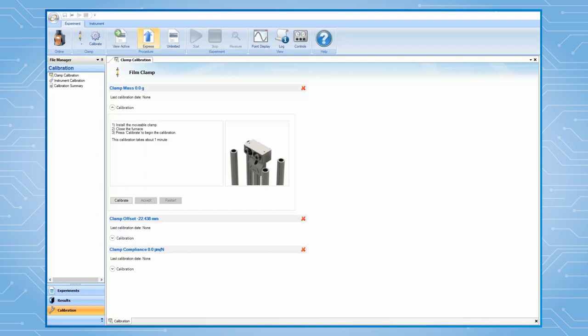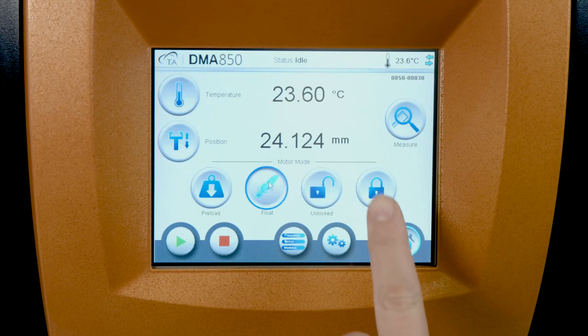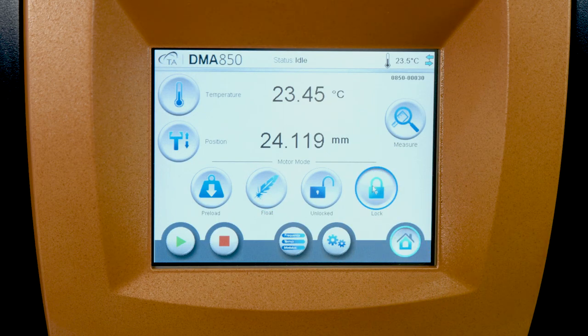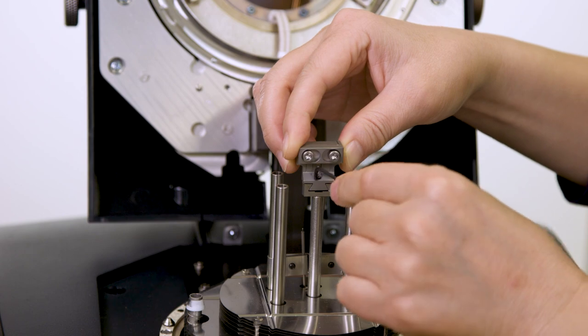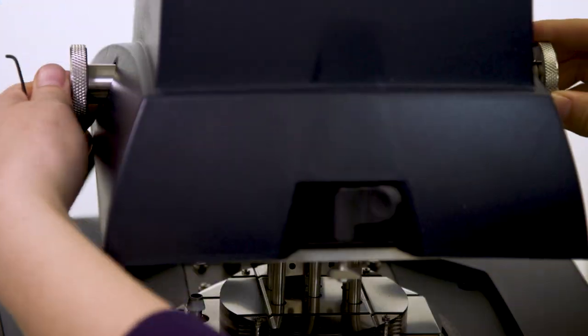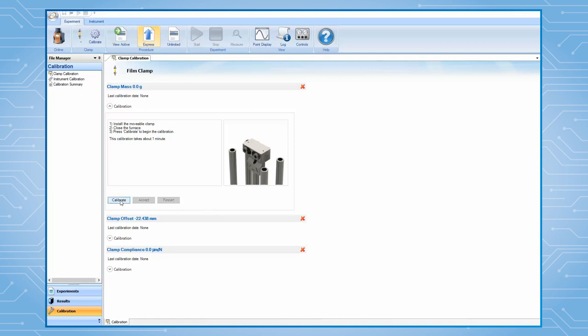The film clamp calibration includes three steps. First, clamp mass calibration. From the instrument touch screen, lock the drive shaft. Install the movable clamp to the drive shaft. Then, close the furnace. From TRIO software, press Calibrate to begin.